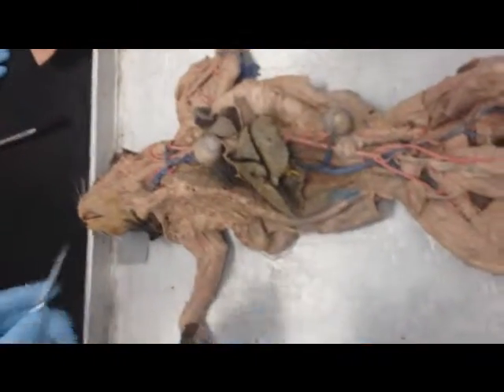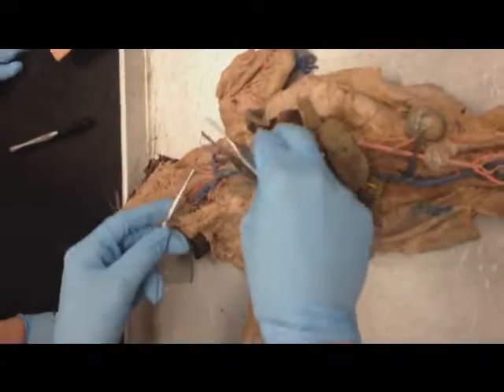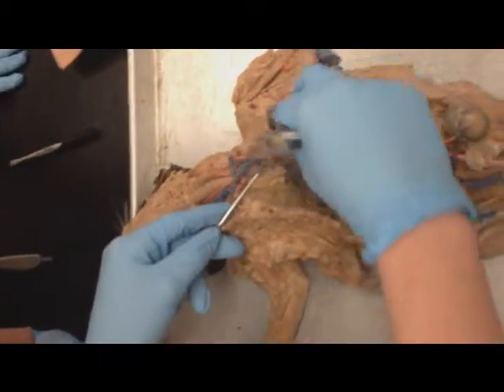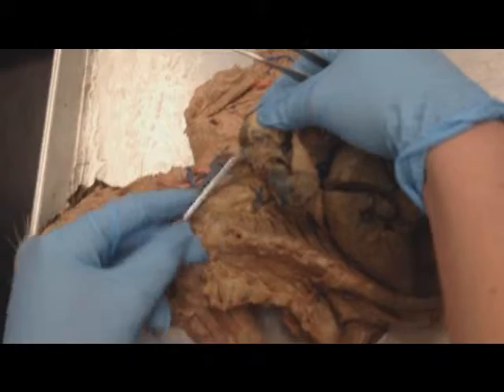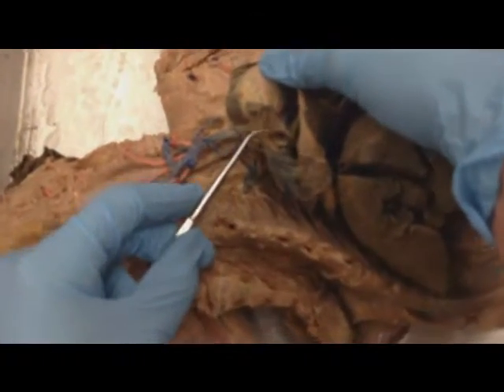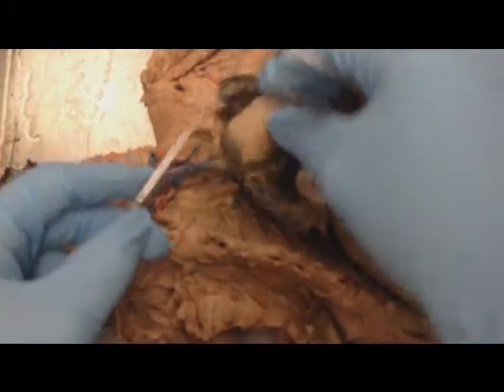Okay. So since you guys are going to have Brian, there's a couple of things that you can name that he'll count. For example, this thin sac right here, it goes around the heart. It's called the pericardium. You see that flap? That's part of the pericardium.